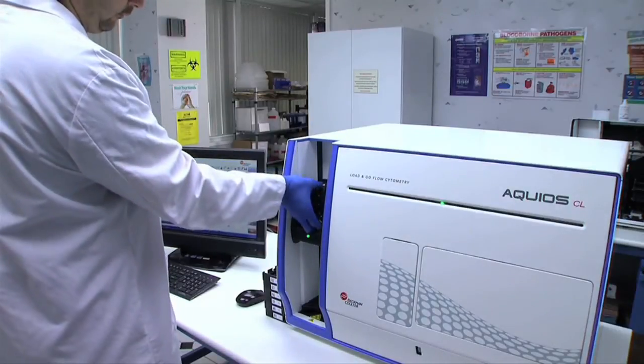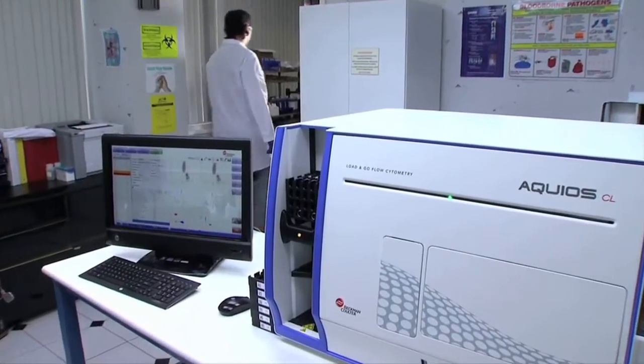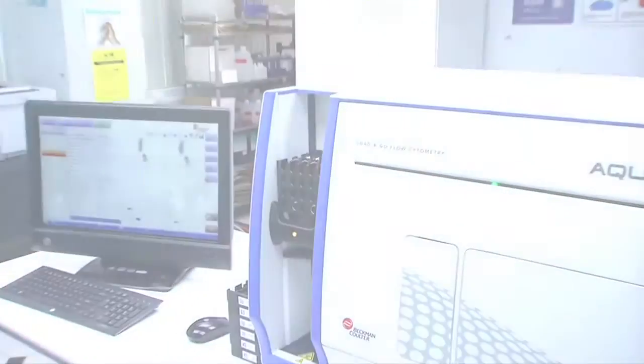I wanted something that was sort of more like a hematology instrument. Acquios has several unique features that set it apart from existing modular systems and make it an ideal solution for routine high throughput applications.